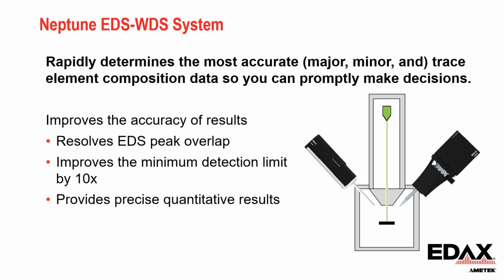With the addition of WDS, it can resolve EDS peak overlap, improve the minimum detection limits by up to 10 times, and provide precise quantitative results.